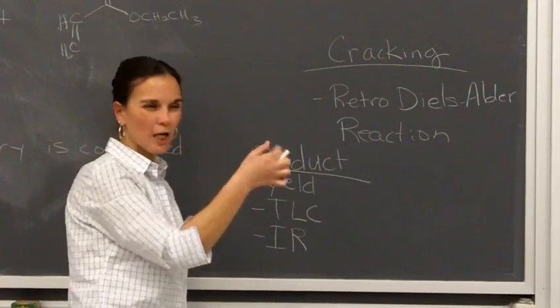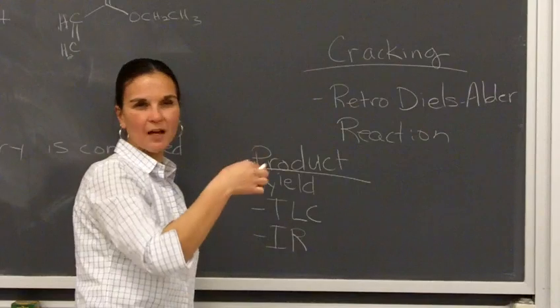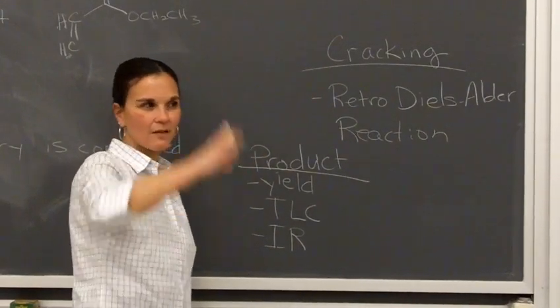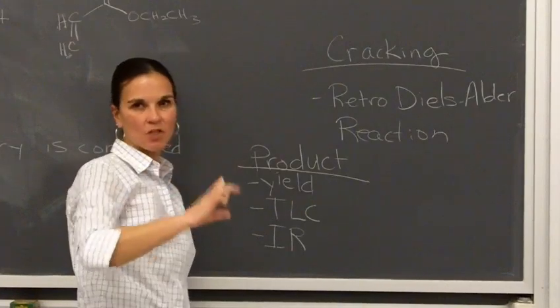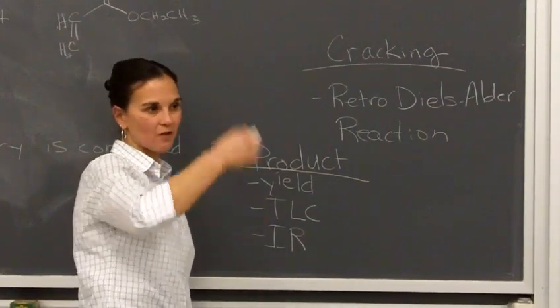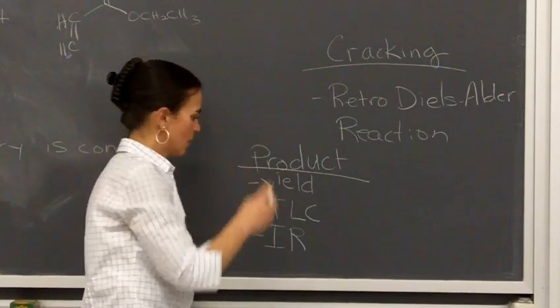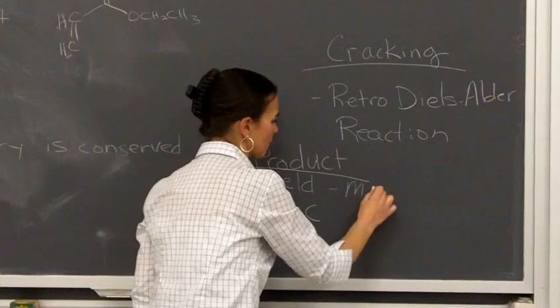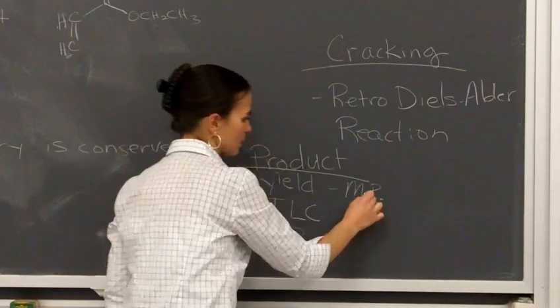Don't crank on the back side of the IRs. I've had people having trouble collecting their IR spectra because the anvil height has been changed. We don't want to change the height. They're set just where they are supposed to be, and if you change the height, you don't get a good spectrum.